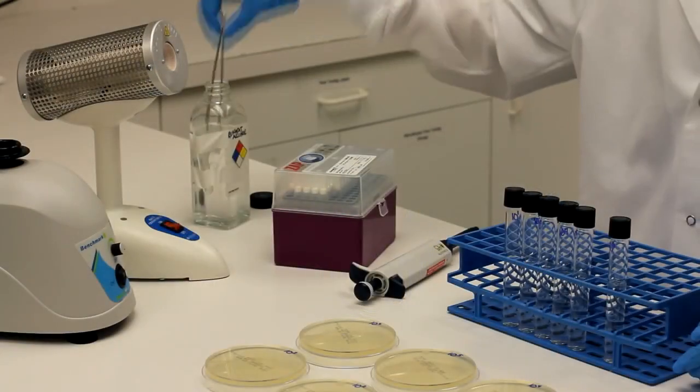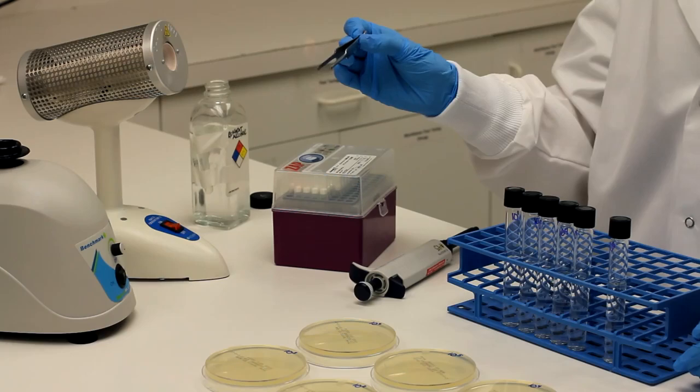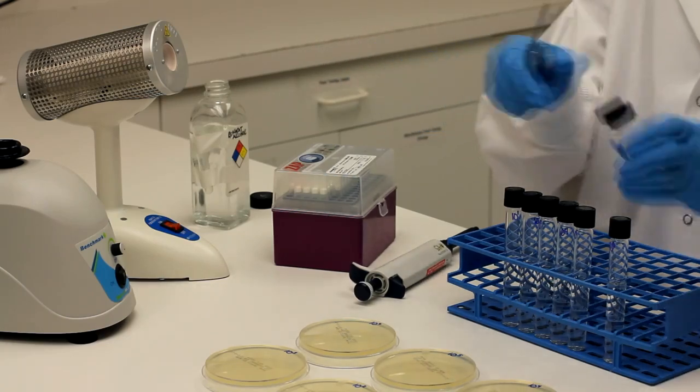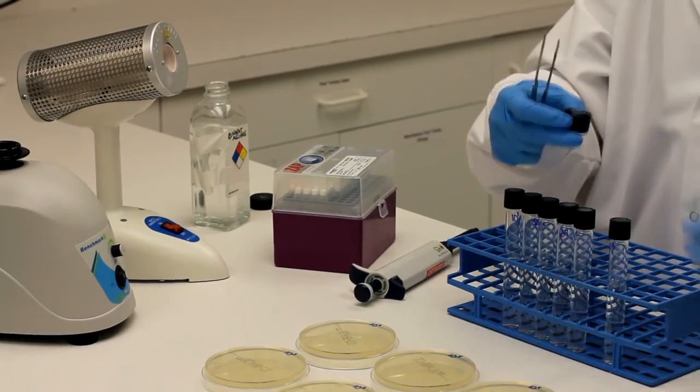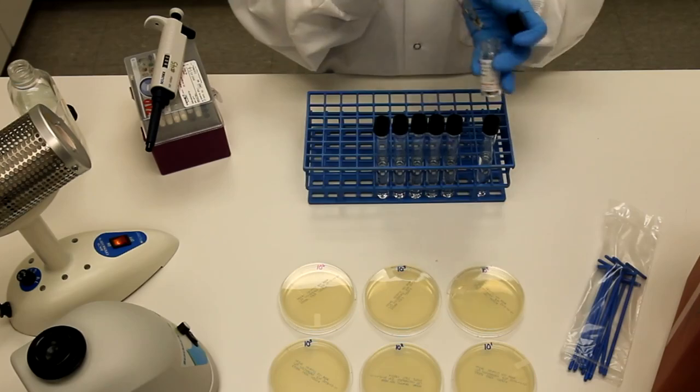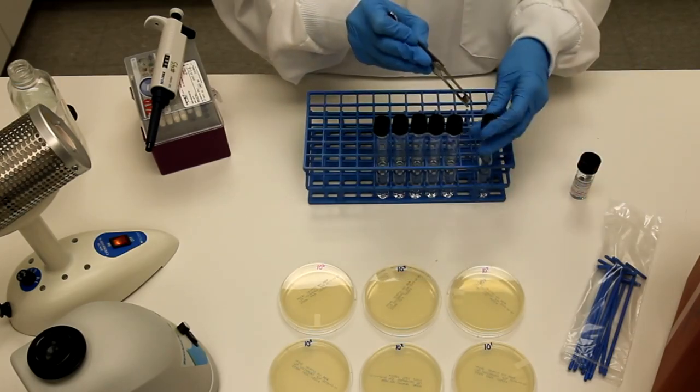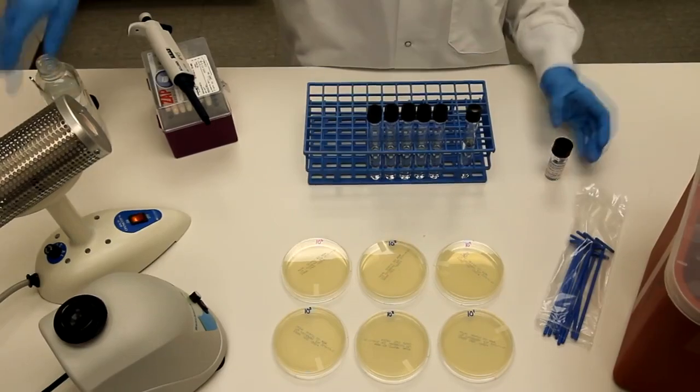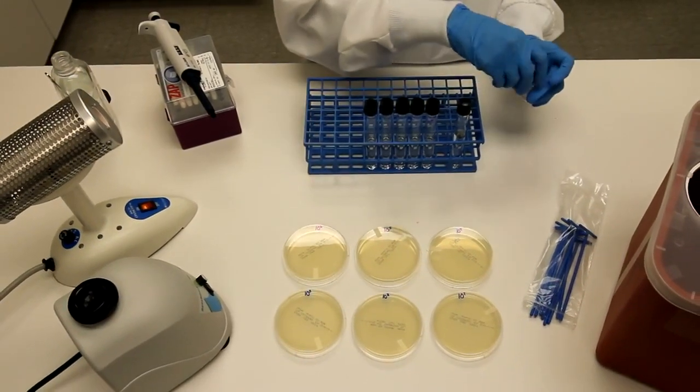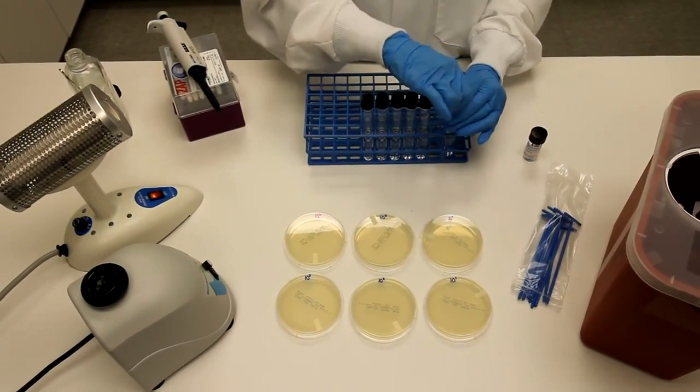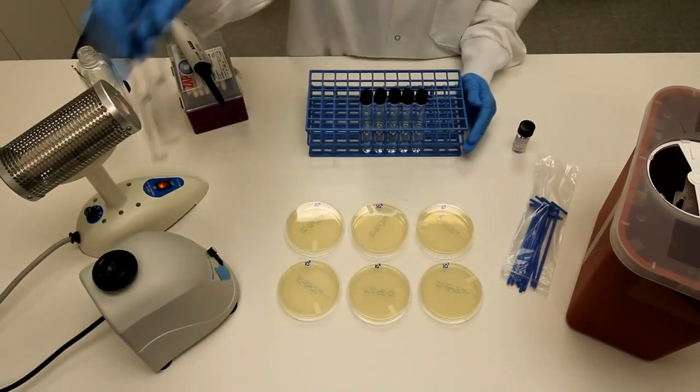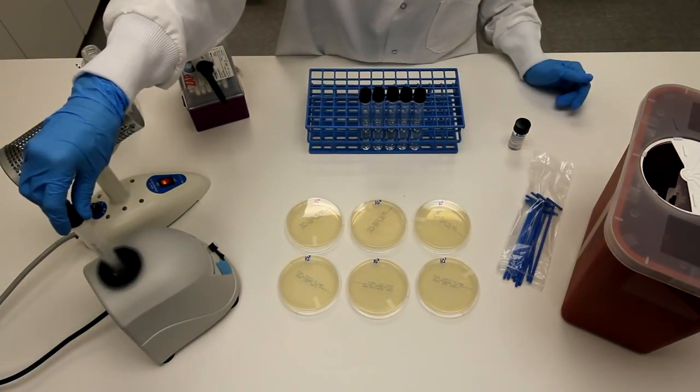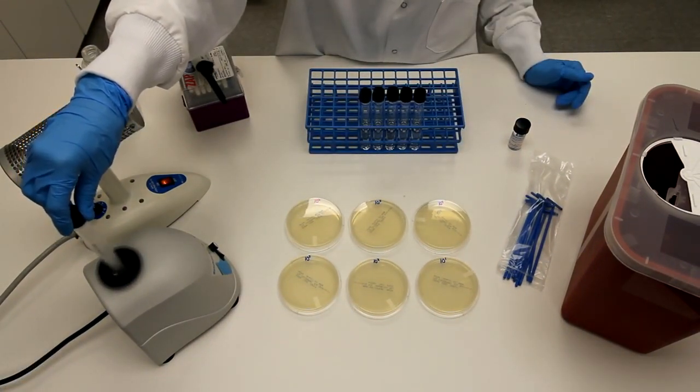Next, using sterile forceps, place one pellet into 10 milliliters of pre-warmed phosphate buffer. Vortex the microorganism suspension to achieve a homogenous suspension.